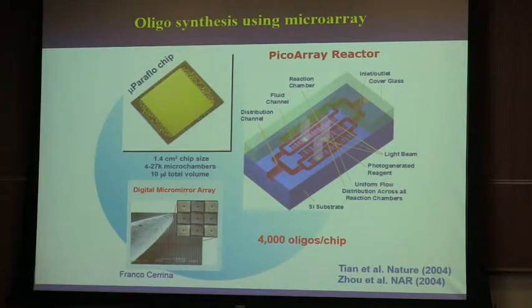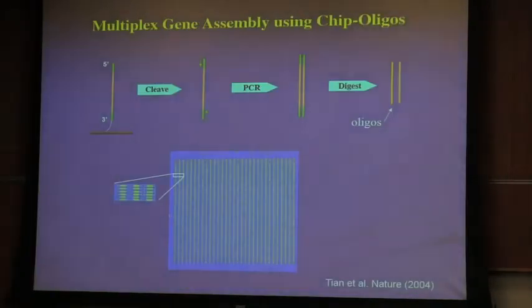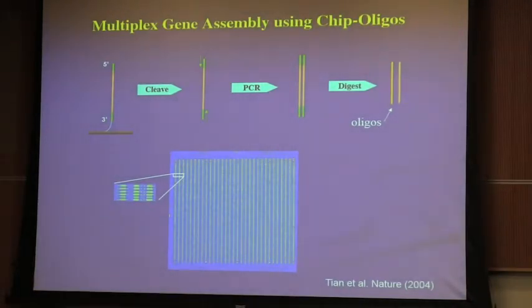So this is the type of microarray we used at that time. If you look at the array, it is pretty small, right? The size of a fingernail, but it can synthesize thousands of oligos on a single chip. Then to amplify the amount of oligos, we developed a design with common primers on both ends, and then you can use a PCR-like reaction to amplify the oligos. You can then remove the primers at the end with a type 2S restriction enzyme and release the clean oligos. You can use those to build genes, right? So in that way, you can get inexpensive oligos from the chip, and it proved that we can use this method to synthesize multiple genes at a time.